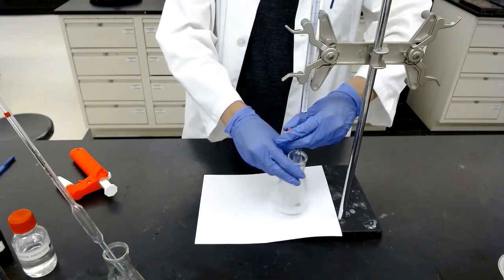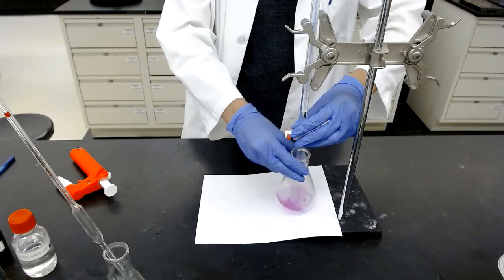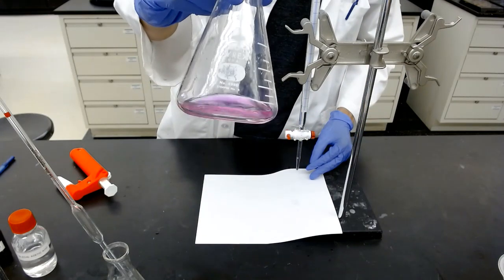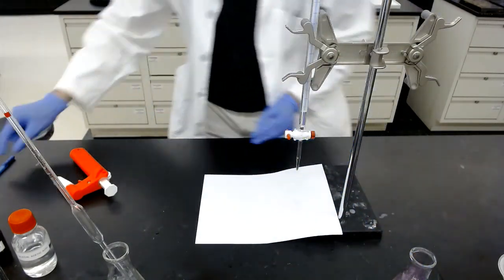Should be getting close now. Oops, there we go. All right, I'm going to stop right here. This is a decent color. Stop. Now we need to read the burette.